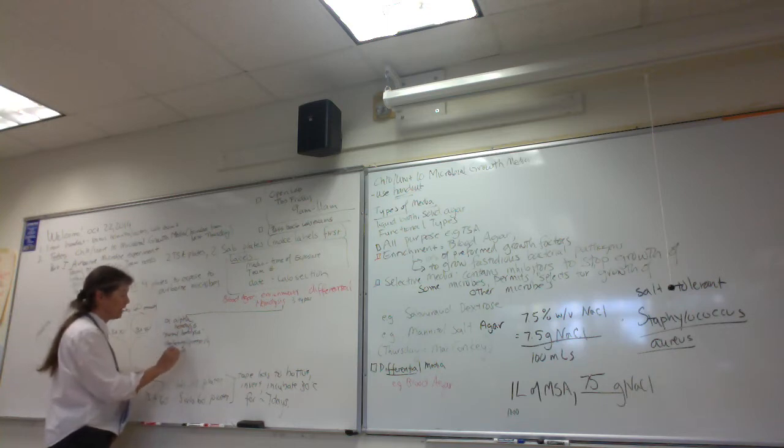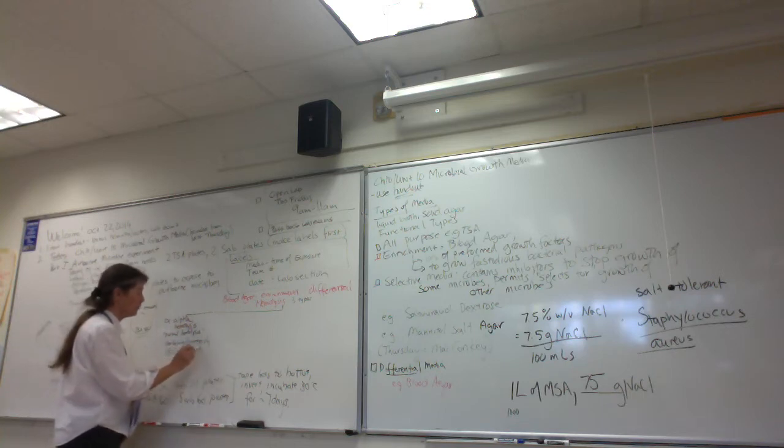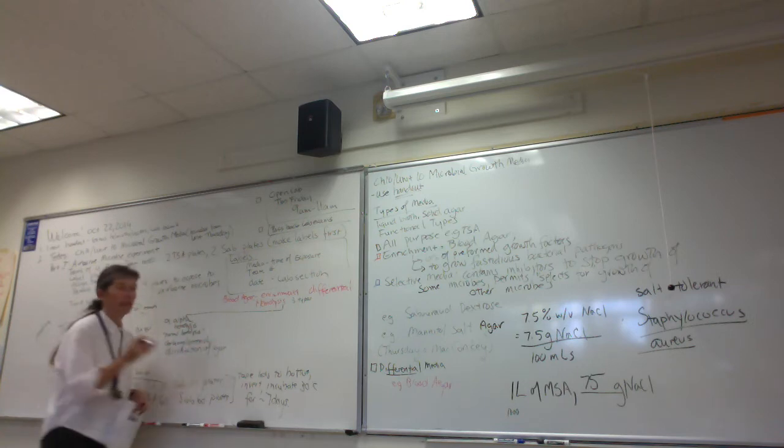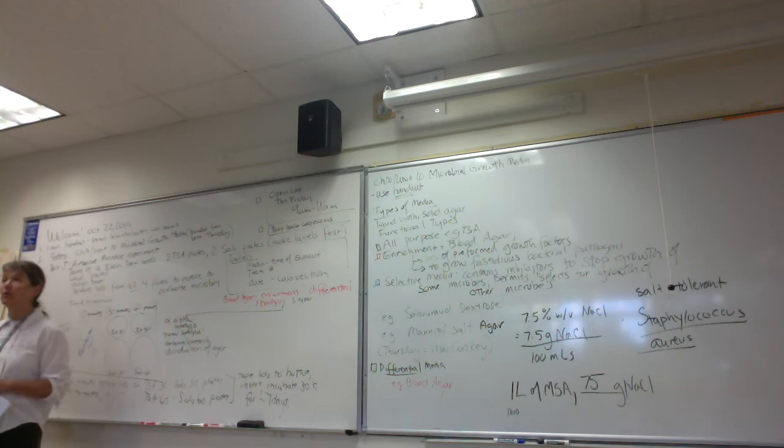And for the lab exam, you guys, I'd like you to know 2 alpha hemolytic bacteria, and this will make sense why the throat swab has a lot of alpha hemolytic colonies, because the oral microbe, Streptococcus mutans, is alpha hemolytic. Folks, why did we discuss Streptococcus mutans? What is it involved in? Yeah, the tooth biofilm, right? They make the slime layers, they stick to our teeth, and they ferment sugar, make acids, decalcify our teeth.